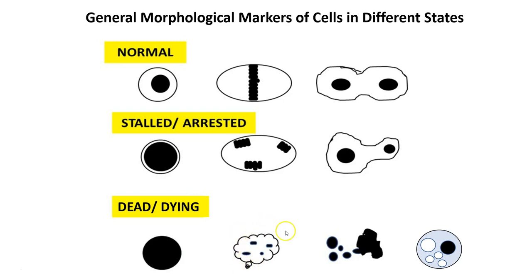You can also see them at an earlier stage undergoing apoptosis, or programmed cell death, in which case you'll see bubbling on the cell membrane and little blebs forming, and the chromatin and nucleus inside may be getting fragmented. This would be an example of an apoptotic cell, a cell dying through programmed cell death. You can see this process at a later stage as just little remaining blebs and cell body remnants present in your stained slide area.